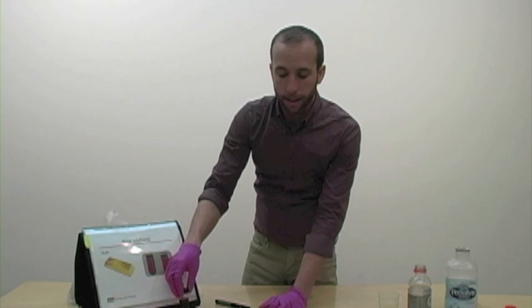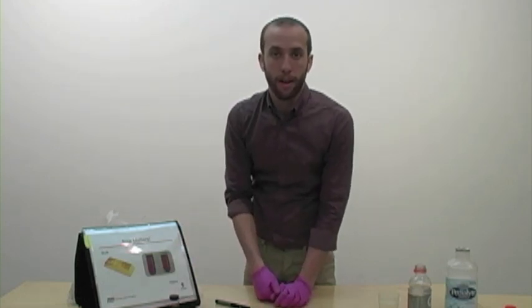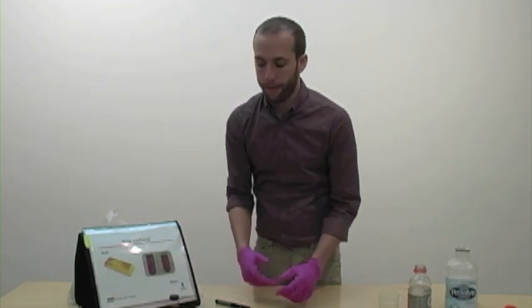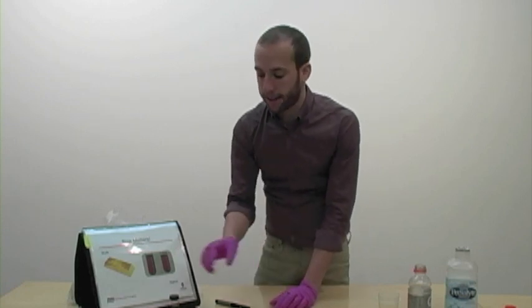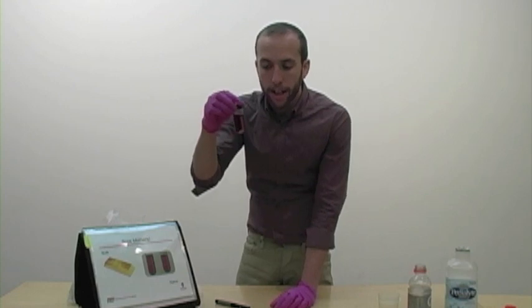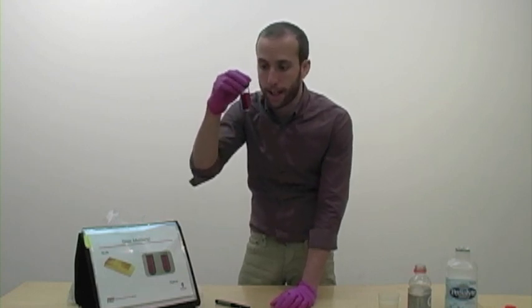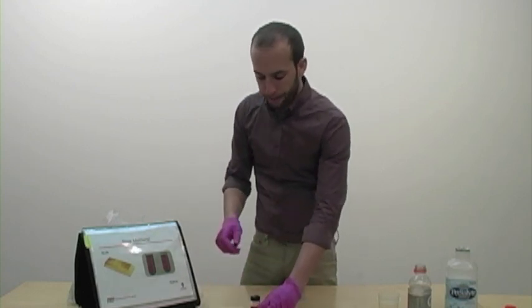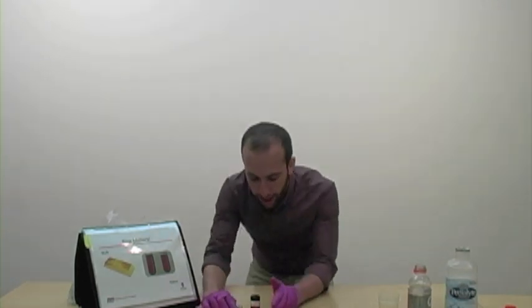Do you know what a nanoparticle is? Have you ever heard of the word nano? Yeah, it means very, very small. We're talking about a billionth of a meter in size, something so small that you actually can't see the individual specks of gold in here. But with the help of this laser pointer, I can show you that they're in there.